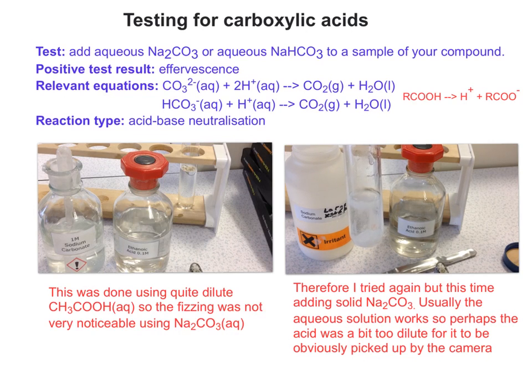And hopefully you can hear the fizzing and see the bubbles. So, positive test result this time: effervescence due to the carbon dioxide gas being given off.